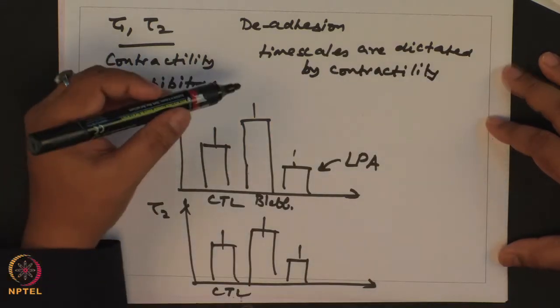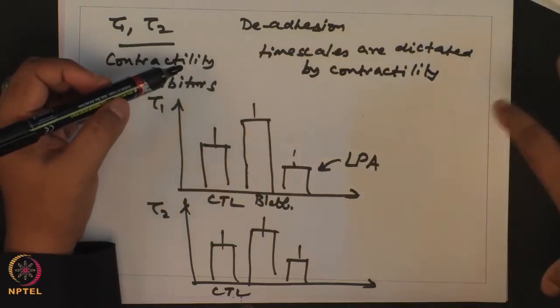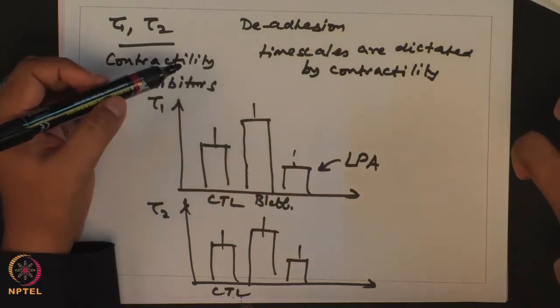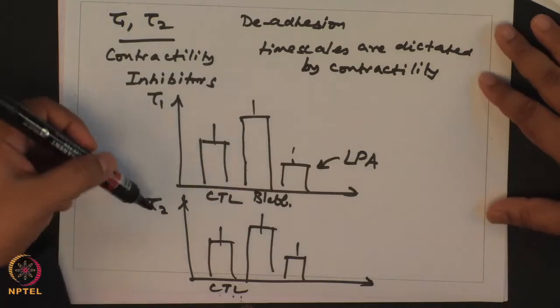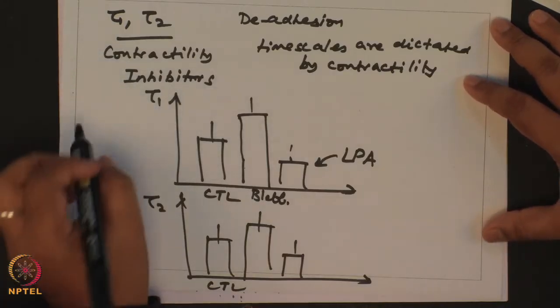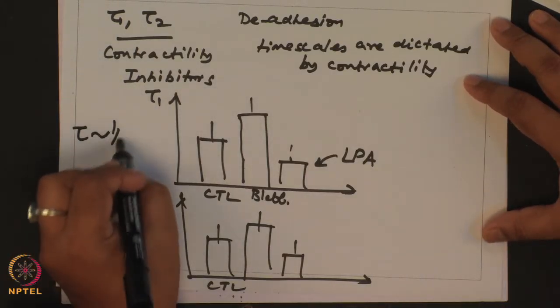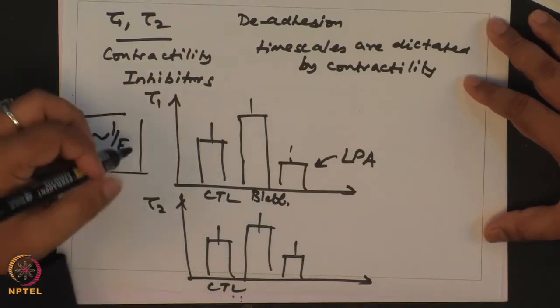Okay. So, if a cell is more contractile in nature, then when you treat with trypsin, it will round up that much faster. What has also been observed, by correlating these time constants with the value of stiffness using AFM, is that tau is generally inversely correlated with stiffness.